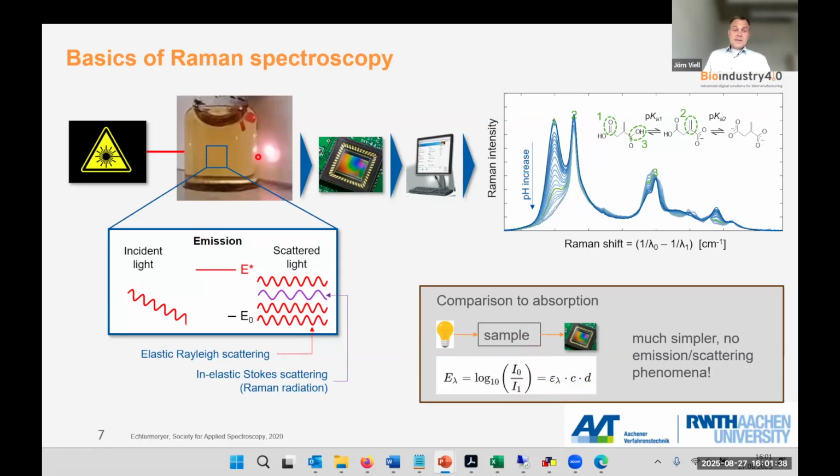The detector is, in contrast, definitely not opposite of the incident light, because we don't want to collect the laser light, we want to collect the inelastically scattered light. That's what you usually do in 180 degrees backscattering optics, or at a dedicated angle. And you have all the effects like turbidity, particles, blocking, deposits, etc. that can also come into play with Raman spectroscopy.